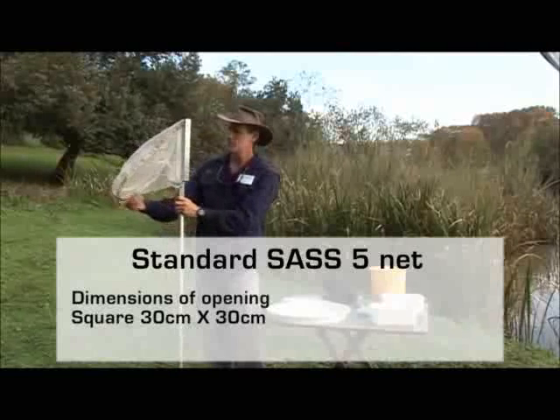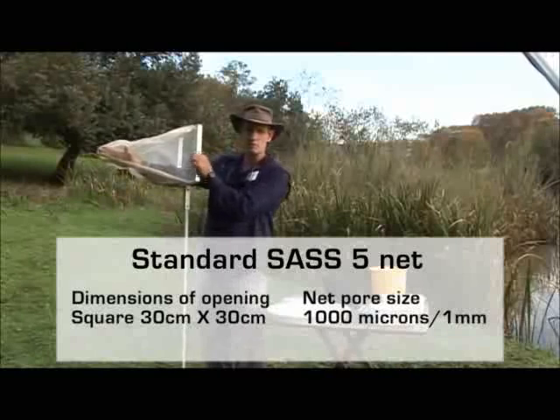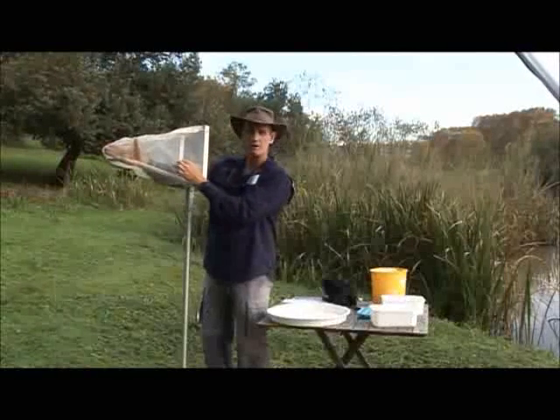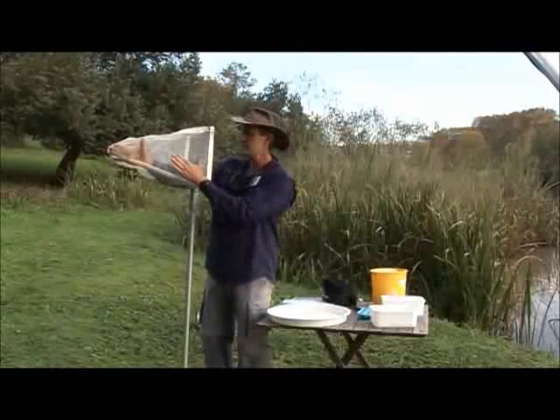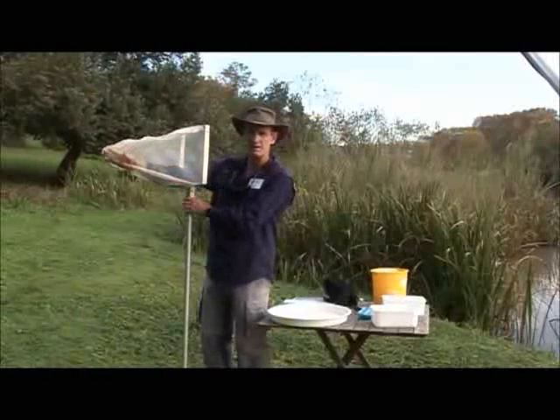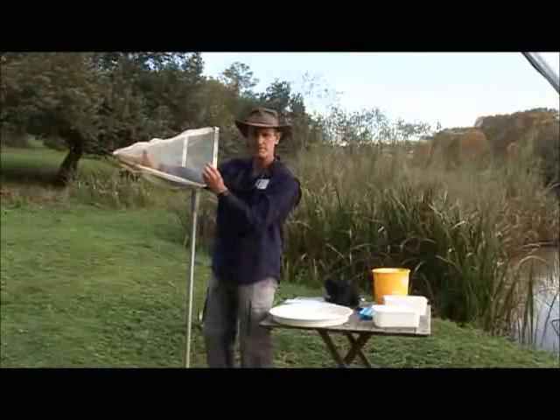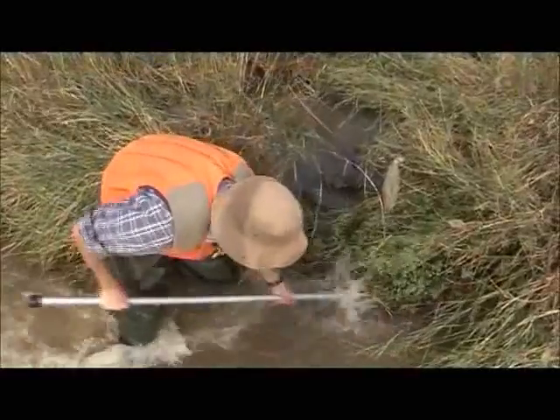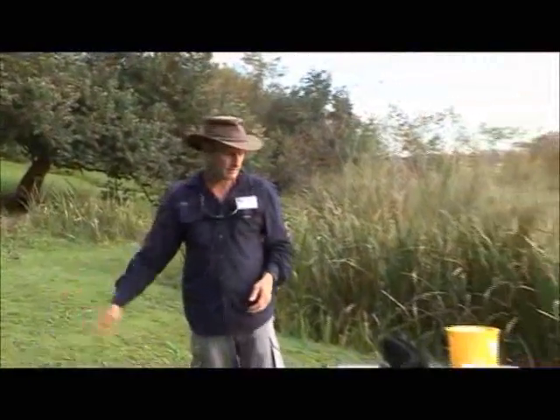The next requirement would be that the net has a pore size of 1000 microns, or 1 millimeter. It doesn't matter what the material is, as long as that 1000 micron is maintained throughout; that is the standard requirement for the SASS net. That's really to allow the small organisms which can't be seen by eye to wash through, and retain the larger organisms that we want to be able to look at and identify. So there's our net. What else do we need?